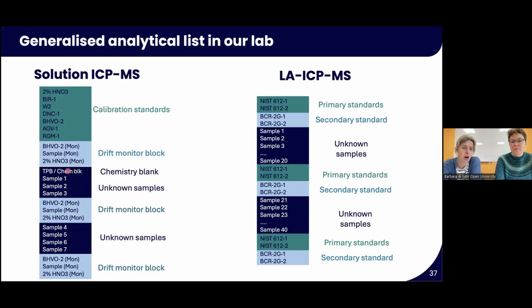At the beginning of our unknowns, before the instrument has the potential to get too dirty, we'd run our chemistry blank or our total procedural blank, and then we're into our unknowns that are separated by these monitor blocks. In terms of the laser ablation, because that wealth of calibration standards isn't available, the setup looks slightly different.